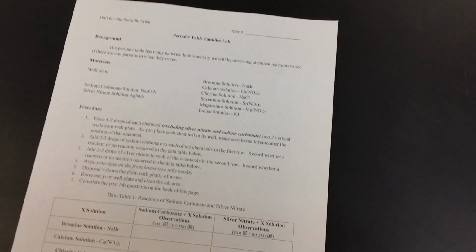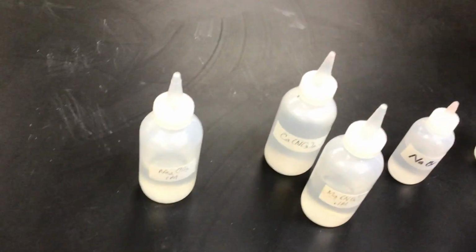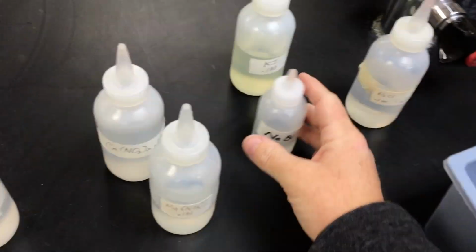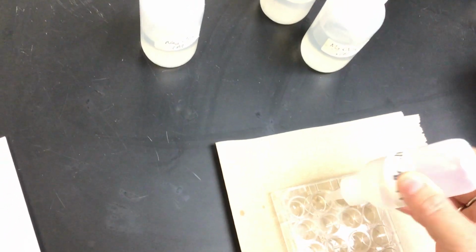So our first is going to be the bromine solution. So let me find that. Sodium, magnesium. So our bromine solution is NaBr. So here's our NaBr. So I'm going to put some NaBr in there.